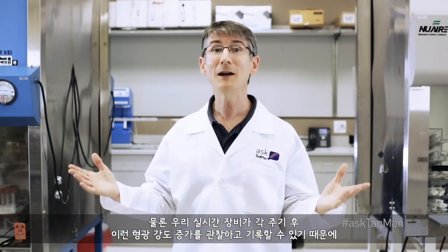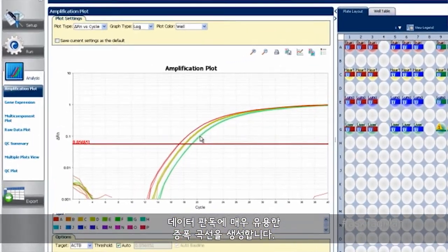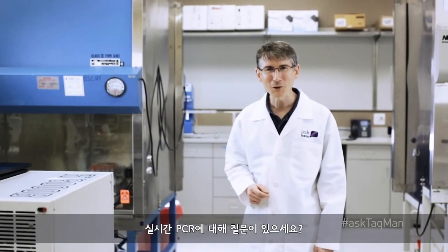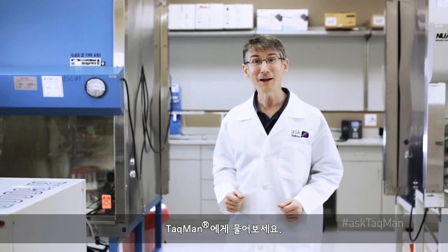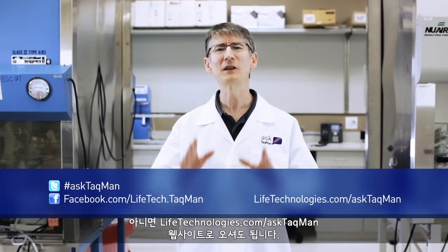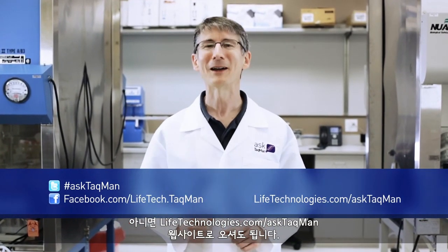And of course, our real-time instrument can monitor and record this increase in fluorescence after each cycle, generating an amplification plot that's more than a little useful for interpreting our data. Do you have a real-time PCR question? Just ask TaqMan — on Twitter using the hashtag AskTaqMan, on Facebook, or visit lifetechnologies.com/AskTaqMan.